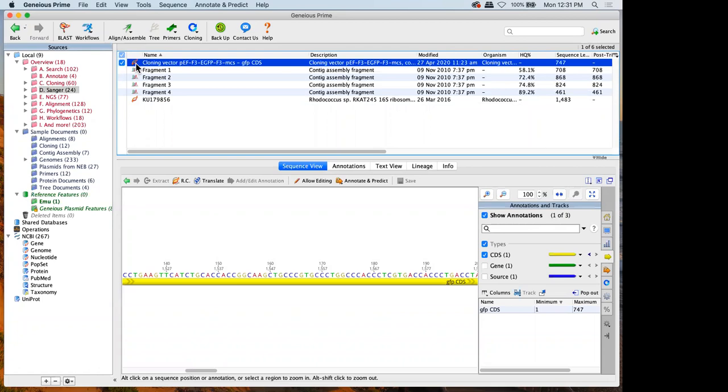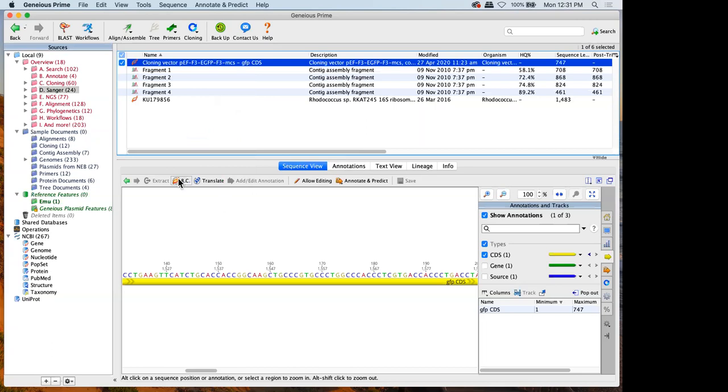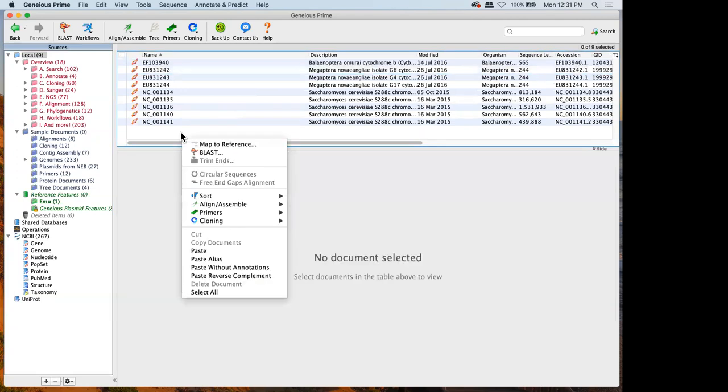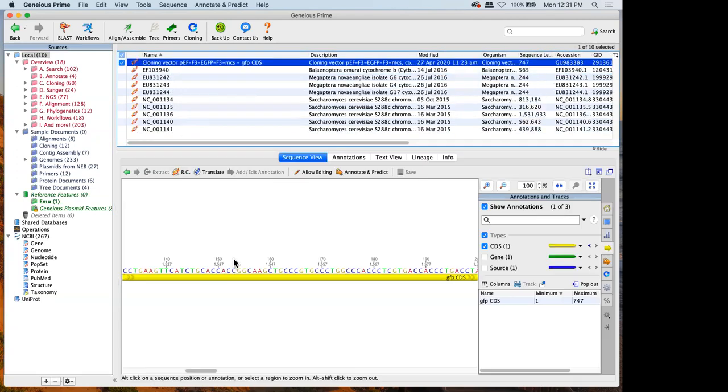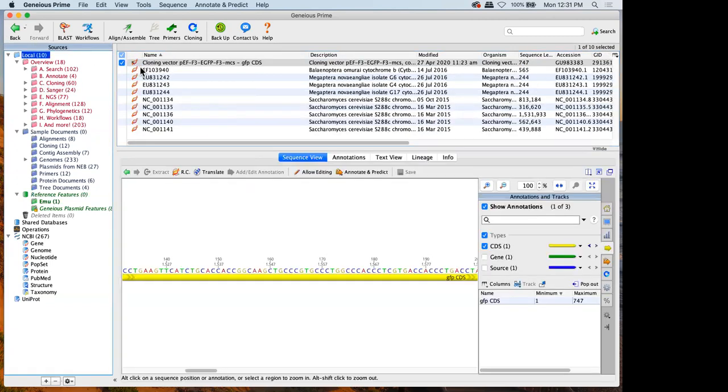One solution is aliases, the other solution is to select multiple folders. An alias is a way of creating a hyperlink or a symlink, whatever term you like to use. So I can have my document here. I'm going to right click and copy. Control C, Command C works as well. If I jump to this folder, right click and I can do paste as alias. This is creating a link to my other document. So if I change it here, it also changes this copy. Same if I make changes here, that's going to affect this copy.